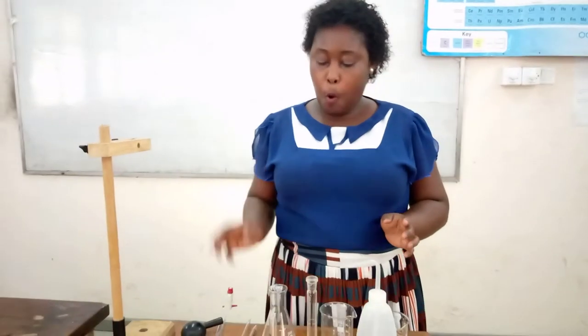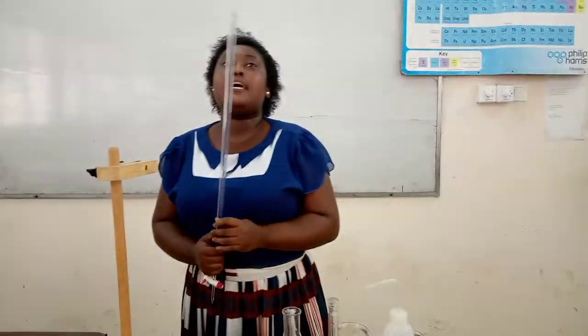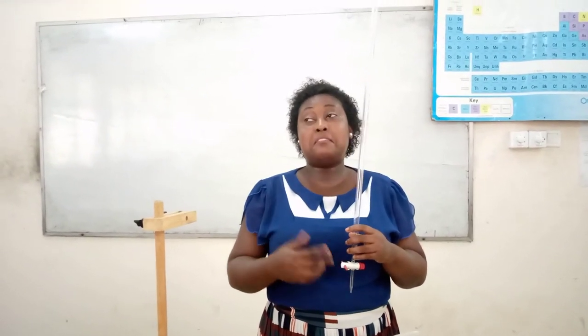These are some of the analytical techniques on the use of pipettes. Now I will go to the burette. The burette, as I said, all liquids should be calibrated at 20 degrees — it shows it is there — and the error margin is also written on it. This part of the burette is called the barrel. And this part — normally students call it a tap, but it's not a tap. The actual name is Teflon stopcock. That is the right name. Because it looks like a tap, you call it a tap, but that is the right word. If Teflon is too much, you can say stopcock for short.